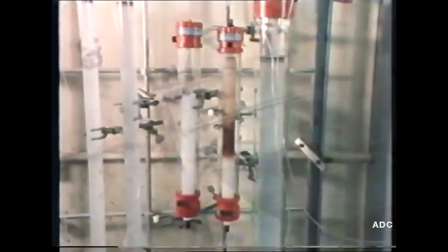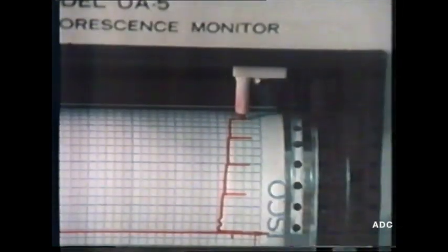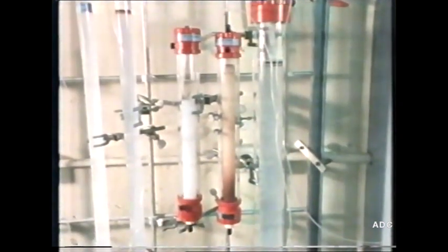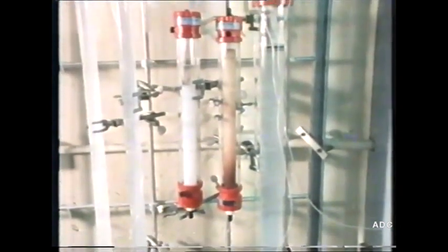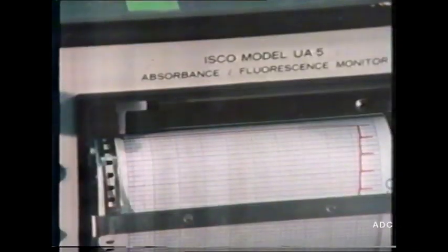After some time, you can see that the red hemoglobin's now over halfway down the column. The solution falls drop by drop into one of the sample tubes. The machine counts the number of drops, and after a certain number, moves the next empty tube into position to collect another portion, and so on. Now the hemoglobin is going to emerge from the column. Like all proteins, it shows a characteristic absorption in the ultraviolet, so the trace will show us that we're now getting a protein. The pen has swept right across the paper.